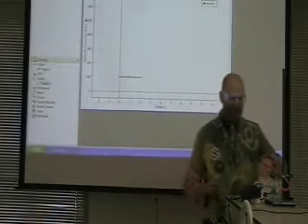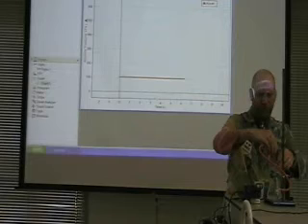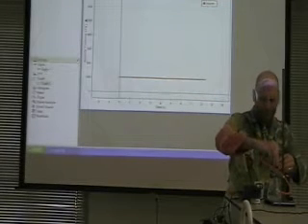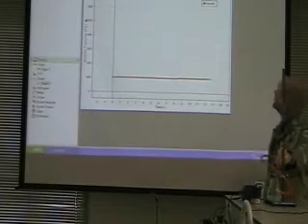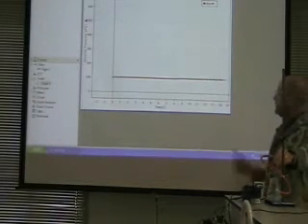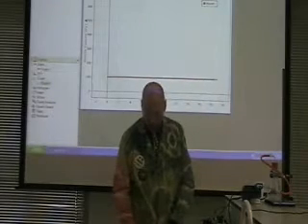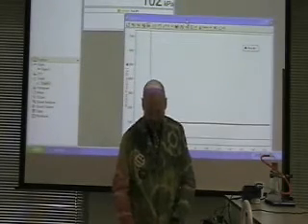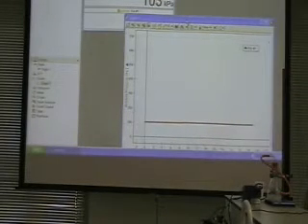It's taking my baseline pressure, and then I dump a bunch of marble chips in there. Put the lid back on. And it doesn't look like much, but that's because of the scale. And if you draw down, you can see this change in the kilopascals going up.